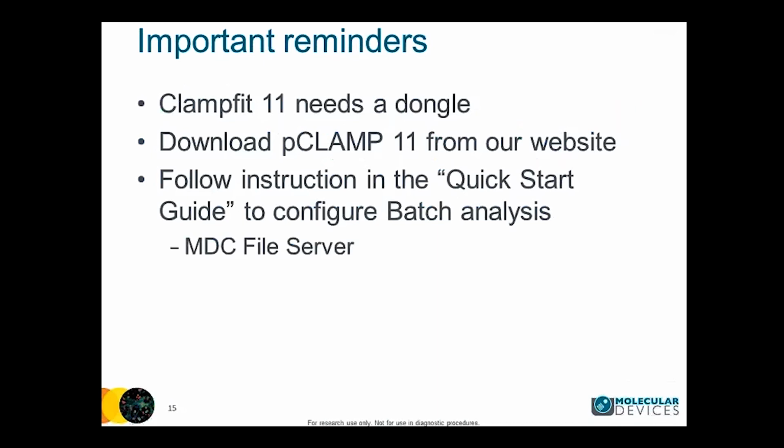Now, I have a few important reminders for you guys. Clampfit 11 needs the dongle to work, okay? I know that people use pCLAMP 9 and pCLAMP 10. pCLAMP 10 does not need the dongle, but Clampfit 11 needs a dongle. So when you order, you will receive 2 dongles, one for Clampex, one for Clampfit. Also, remember to download pCLAMP 11 from our website, okay, from our website.